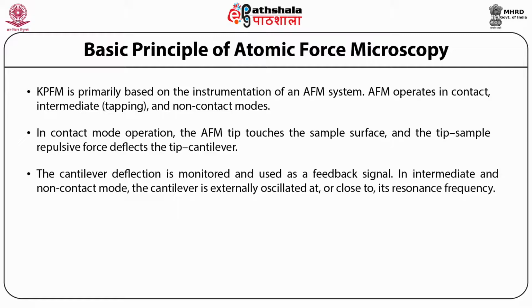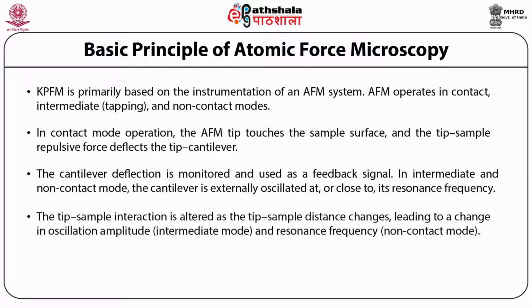In intermediate and non-contact mode, the cantilever is externally oscillated at or close to its resonance frequency. The tip sample interaction is altered as the tip sample distance changes, leading to a change in oscillation amplitude, that is intermediate mode, and resonance frequency.